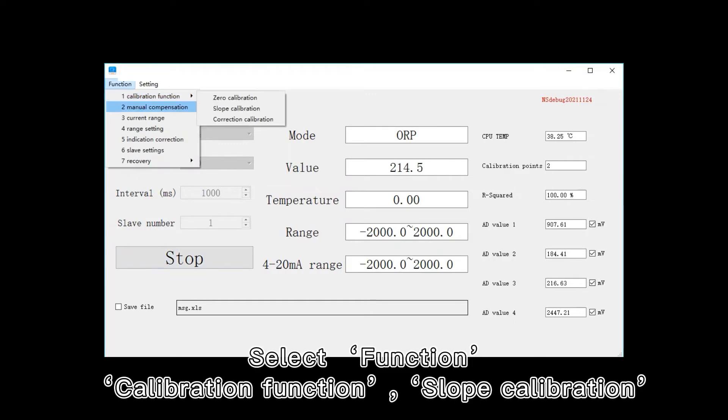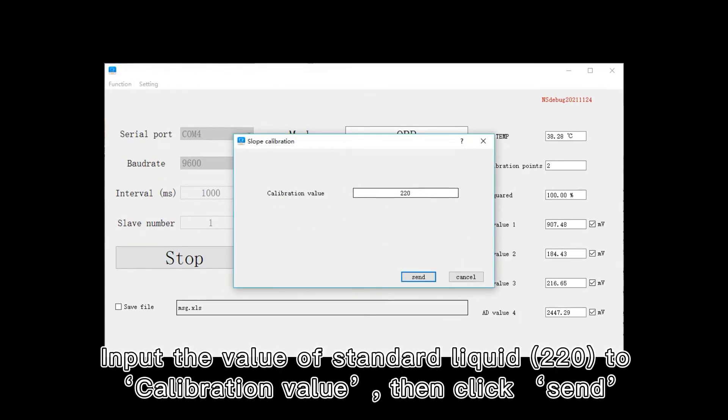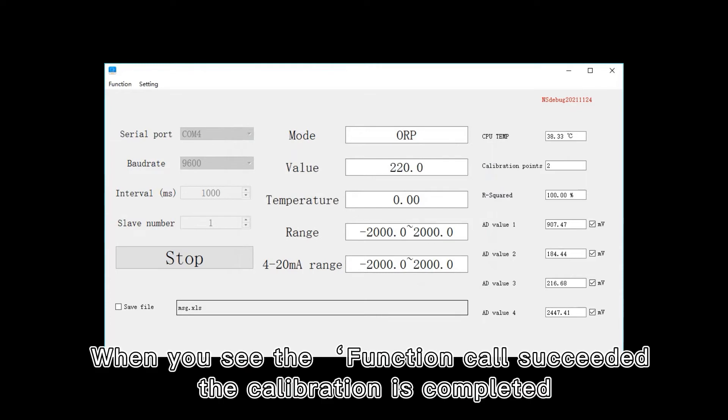Select function, calibration function, slope calibration. Input the value of standard liquid, 220, to calibration value, then click send. When you see the function call succeeded, the calibration is completed.